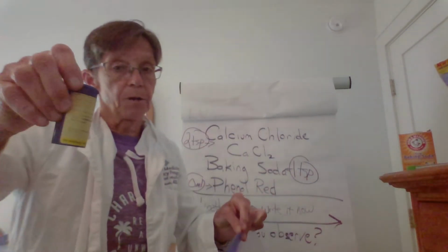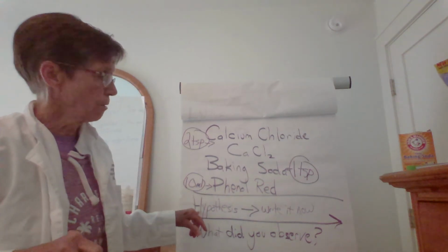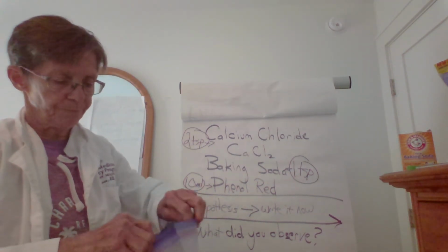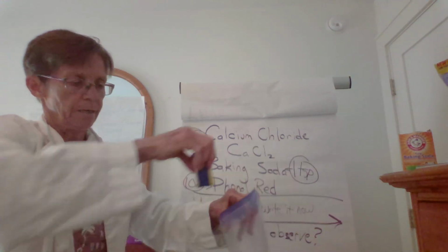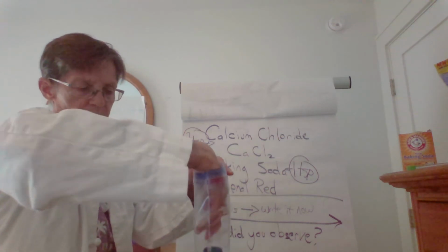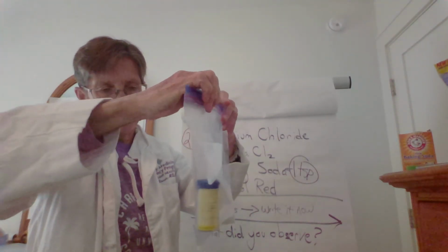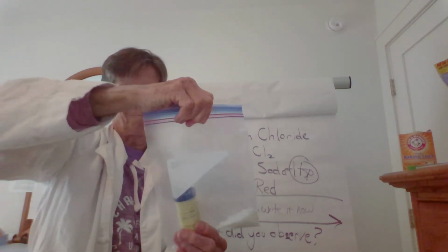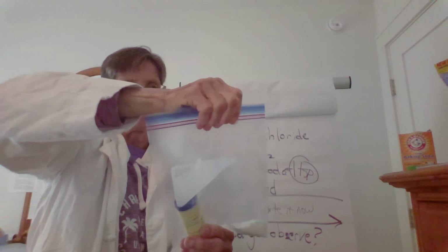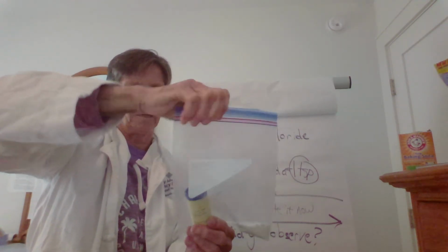Now, the next thing I'm going to do, and this is what you have to do. You got to write your hypothesis. What's going to happen when I do this? And hopefully you've already written your hypothesis. But I'll stand this up like this in the corner, very, very carefully. And I'm going to hold it at the bottom. I'm going to Ziploc this bag up really well. Gotta love Ziploc science. So much you can do with the Ziploc bag.